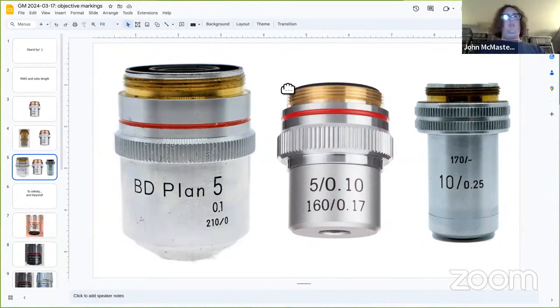So they said, well, with 160 millimeters, it's just enough for me to put the oculars, the things you look into, and for that to be ergonomic. So they said, well, let's add 50 millimeters, getting to 210 millimeters, so that we can put some additional filters and stuff in there, and that's how you get this 210 over here. I think that's literally where that comes from: let's get a little more wiggle room to put some accessories in.